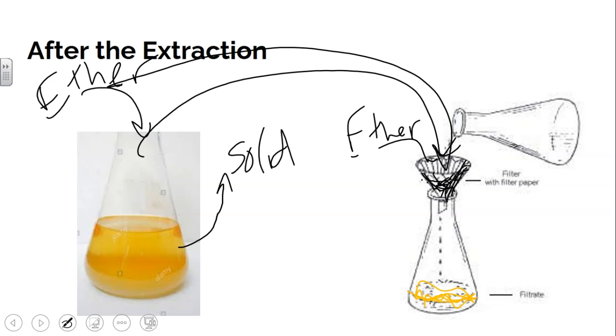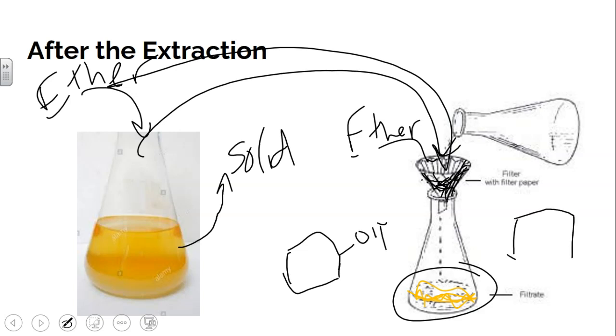So now you could take this, and it's all liquid, and cyclohexanol and cyclohexanone are liquids. And so going back to Organic One Lab, how do you separate a mixture of two liquids? Exactly right. Okay, so this is a great way to do some crude separation to get ready to do your final separation.